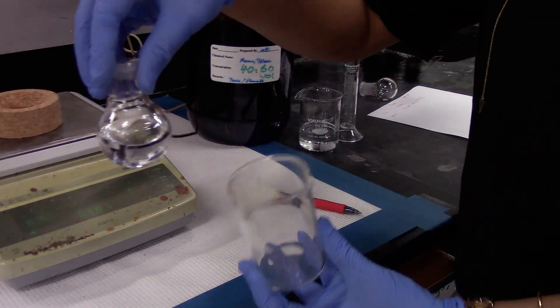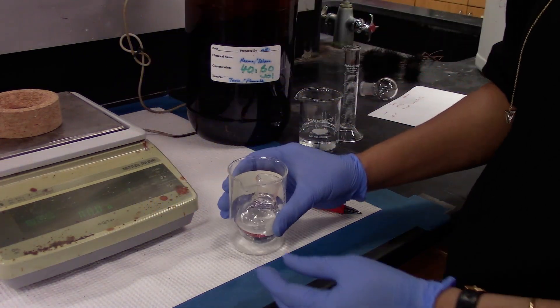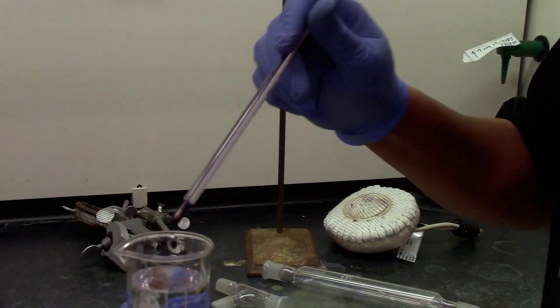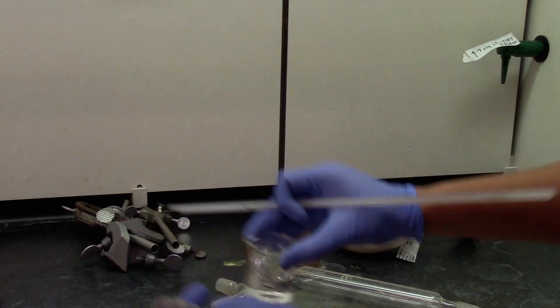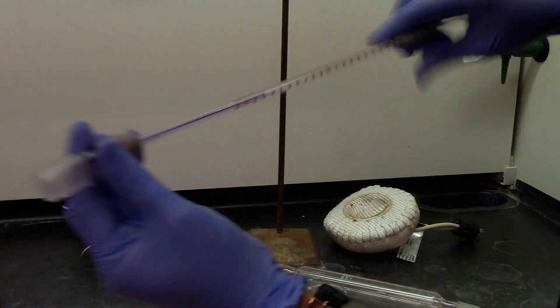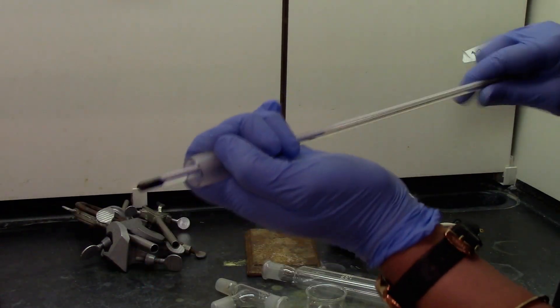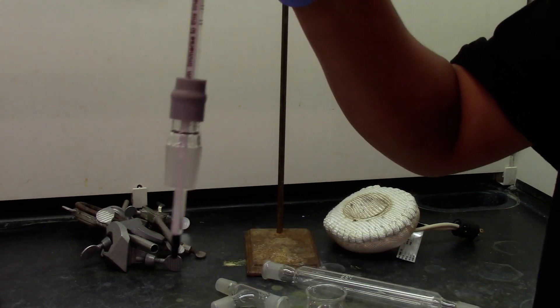So now my mixture is ready. We are going to set up the glassware. You need a thermometer and a thermometer adapter. Use some tap water as a lubricant and dip your thermometer to help you easily put it into the adapter. With twisting, your thermometer will be inside the thermometer adapter.